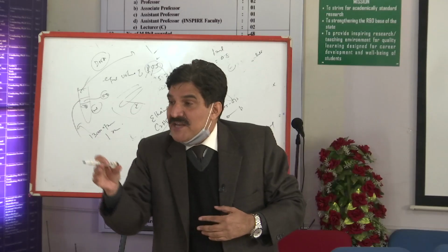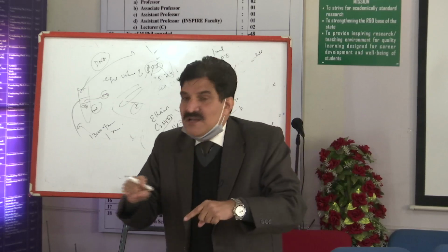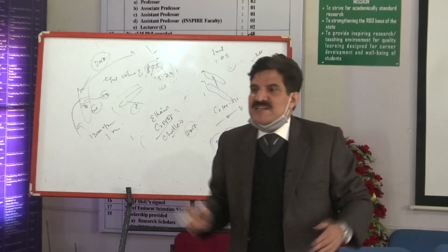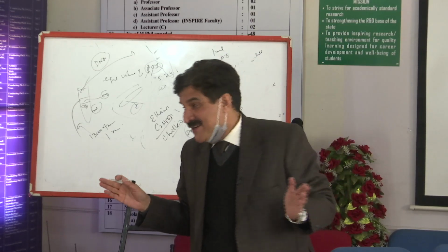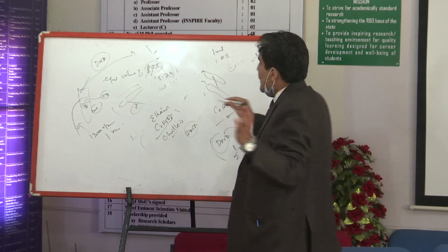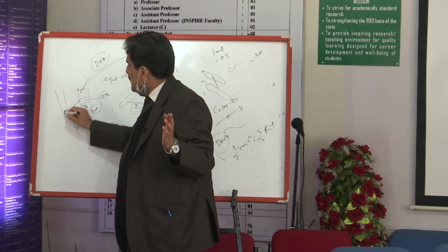Third thing, your DNA molecule is vulnerable to alcohol at higher temperature, because it is seeping deep into the base structures. Low temperature prevents that, because at low temperature the denaturation process is to some extent prevented, controlled. Did you understand this much? This was a very important point. And what is happening? After addition of this alcohol, you are going to have precipitation of DNA.